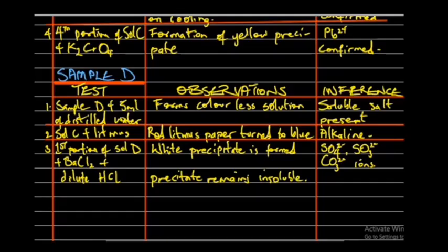So that gave us an inclination that we had SO4 2- present. We couldn't stop here, so we went further to test again.